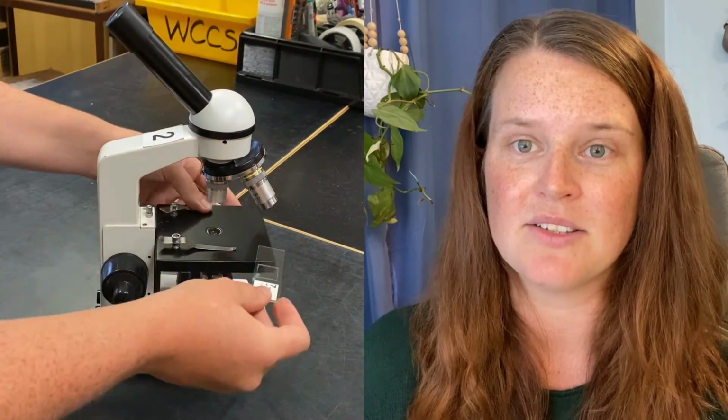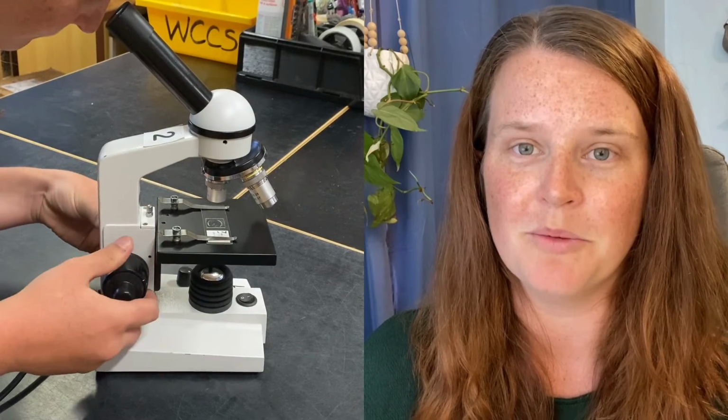So, to set up your microscope, you first ensure that it is plugged in and placed on a flat surface. Ensure that the stage is completely down and the objective lens is set to the smallest lens. Place the slide on the stage flat, ensuring that the sample is over the hole in the stage. Secure with the stage clips. Turn on the lamp and adjust to a moderate brightness.